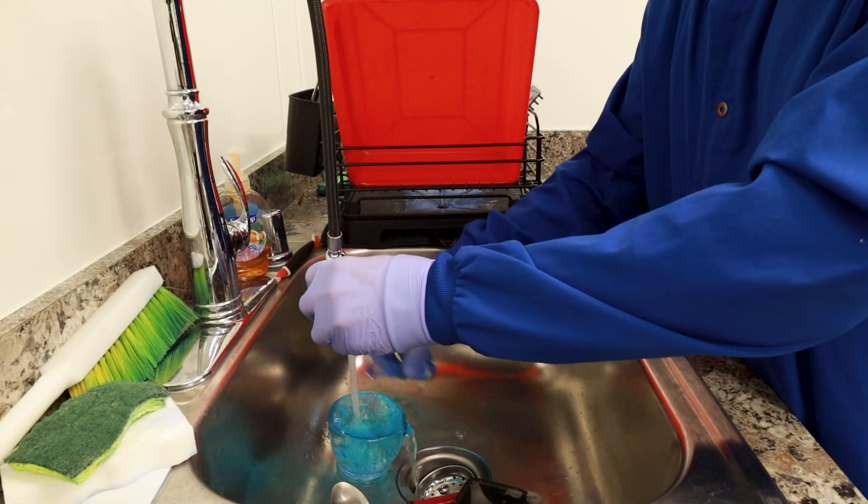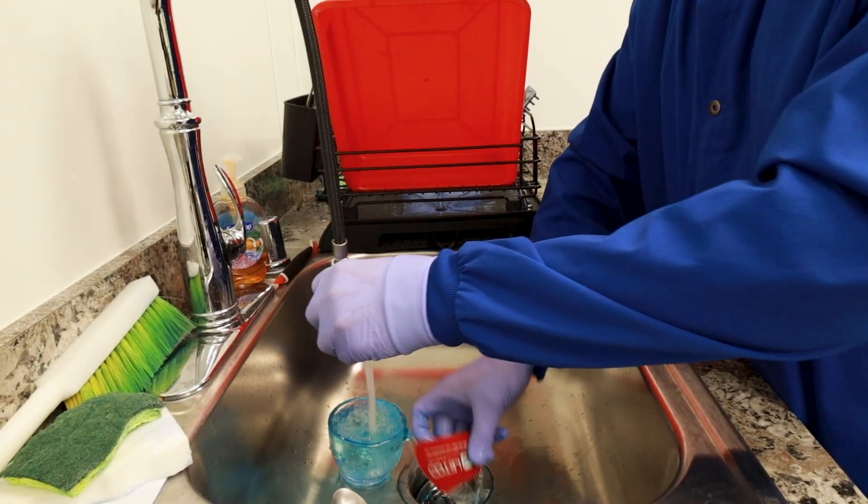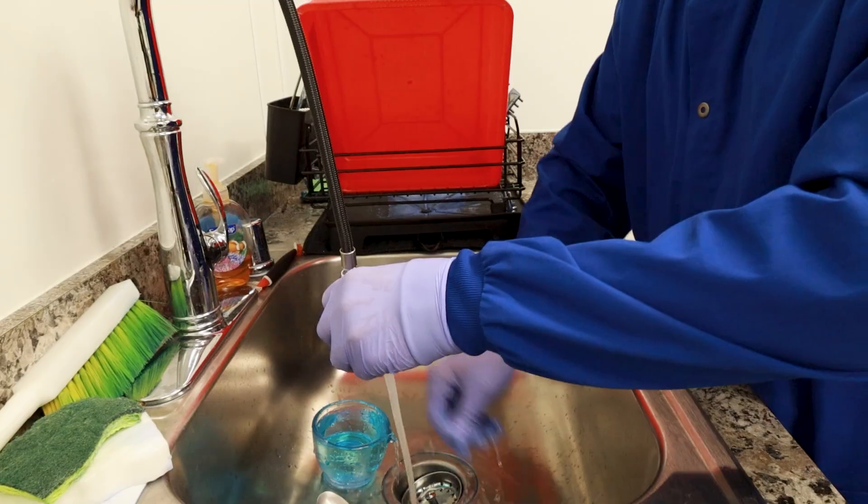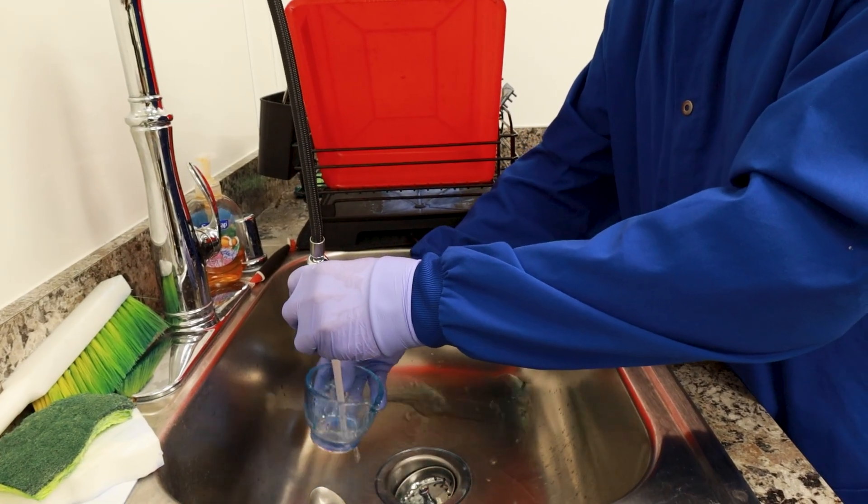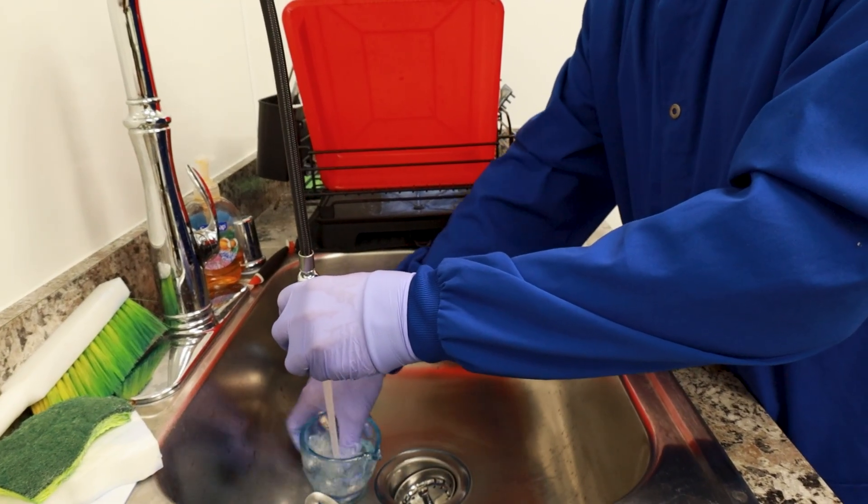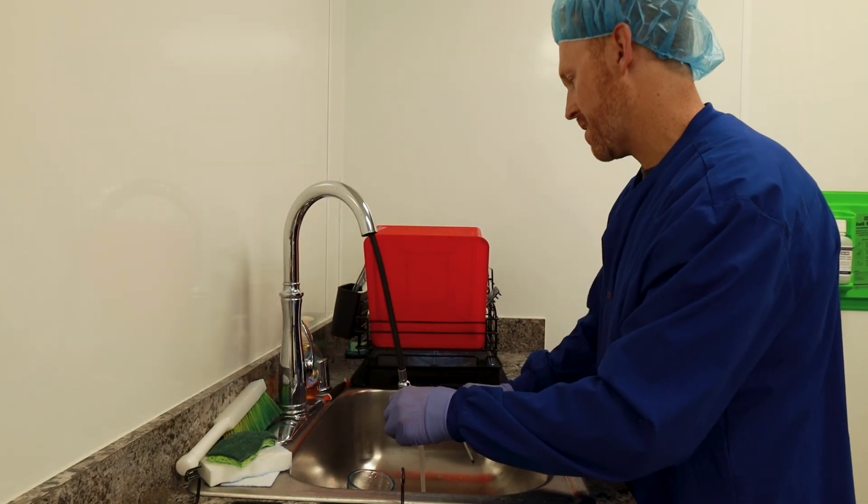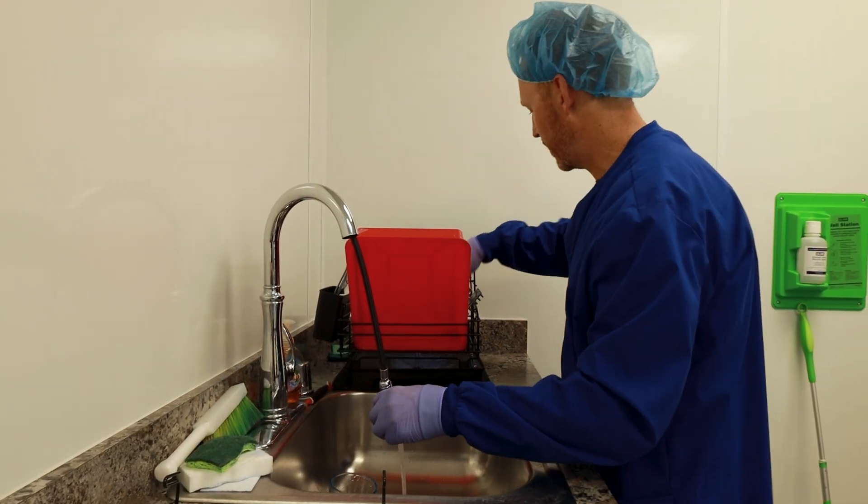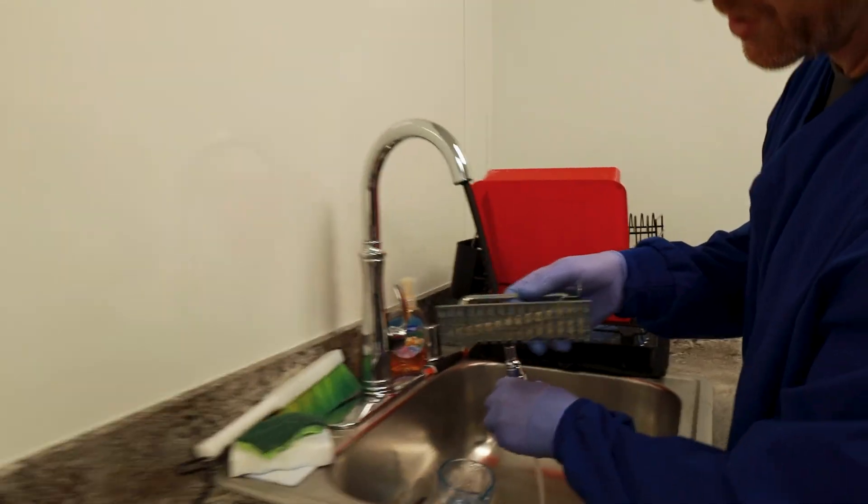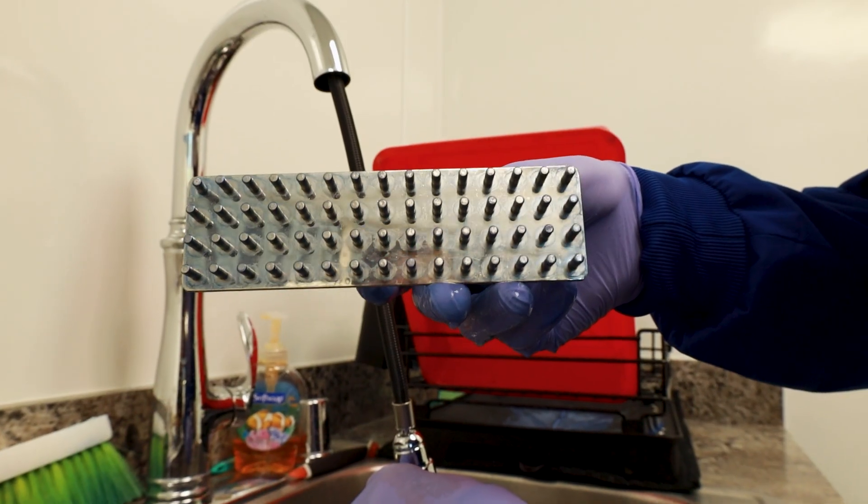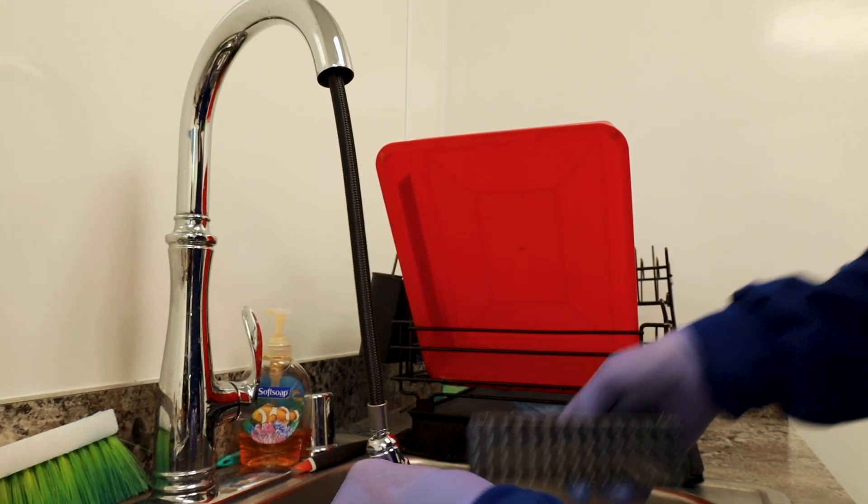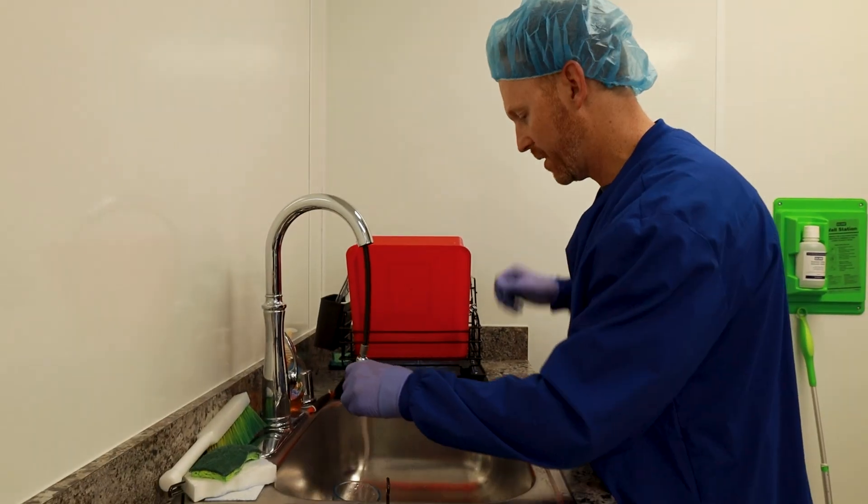Yeah, that's crazy blue. And that's why you were saying that, obviously, it stains immediately. And you said that it stains indefinitely. Yeah, I mean, it's almost impossible to get out. Anything that this touches, even this stainless steel punch, you can see there's a stain to it. Yeah, a little hue. Yeah. So it's really hard to get this stuff perfectly clean.